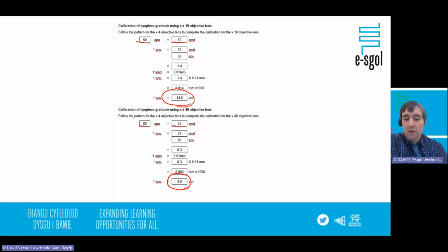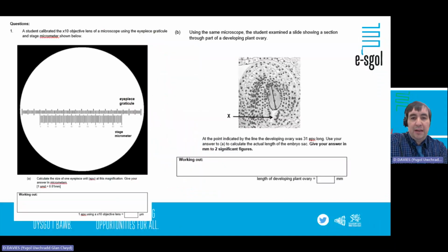Now we're going to have a little practice. This picture is slightly better. I would like you to stop the video and have a go at calibrating question 1A.